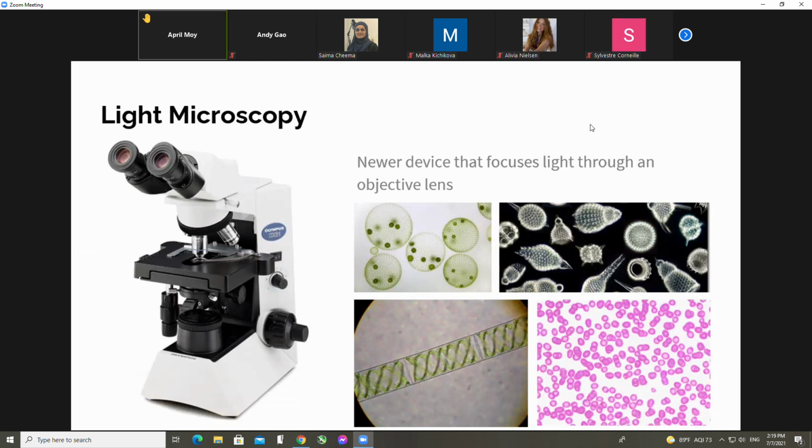So the magnification of the objective lens is 10x, and then the arms in the spinning thing also have magnification, and so we multiply them together to get the total magnification. Okay, you mean the ocular lenses, right? Those have the 10x, and they're generally fixed. That's the only one you have. Generally it's 10x, but other microscopes can have 15x or it can change; the ones we use in a laboratory setting have 10x ocular power.